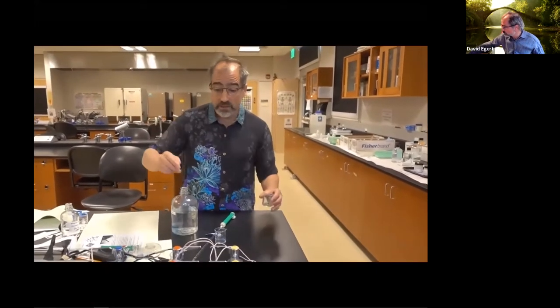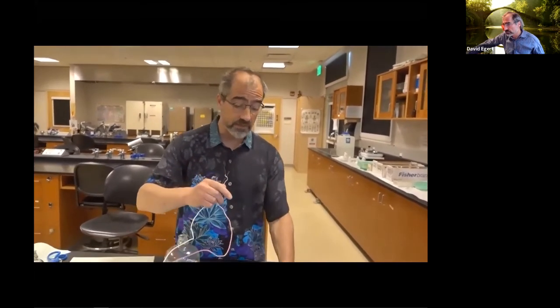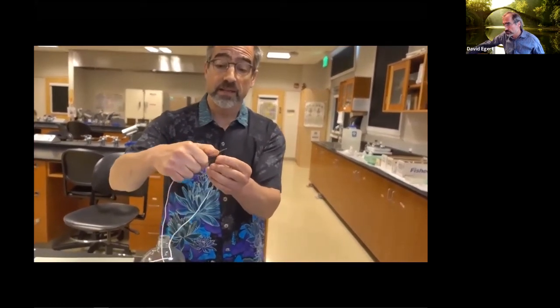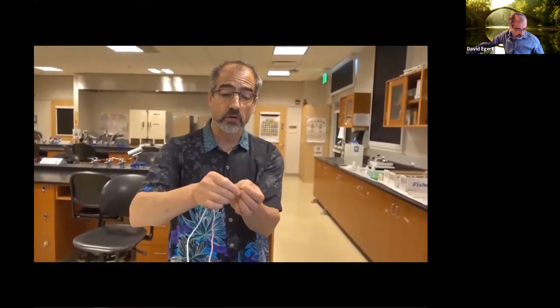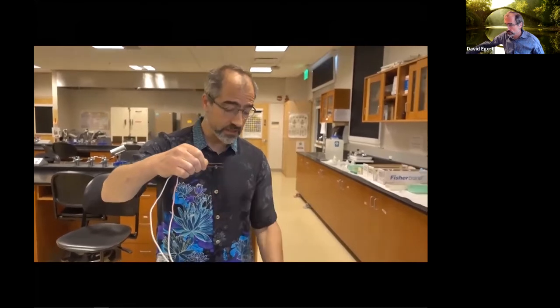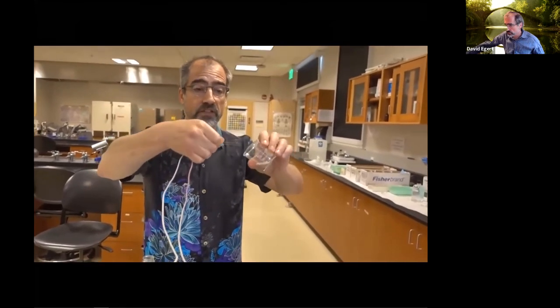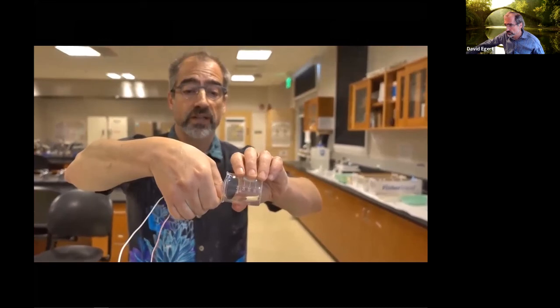So here we looked at, does it dissolve or not, which we did with the electrolytes. We can now look at the electrical continuity. Again, I'm double checking. Yep, system is online. I'm going to hold my little wires parallel so they're not touching. And now I'm going to fully submerge them under this sugar water.